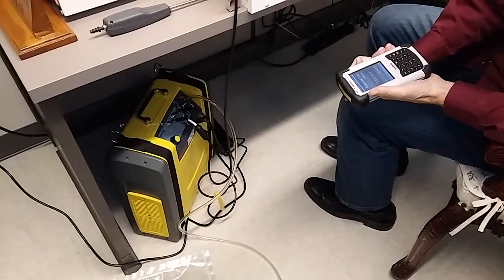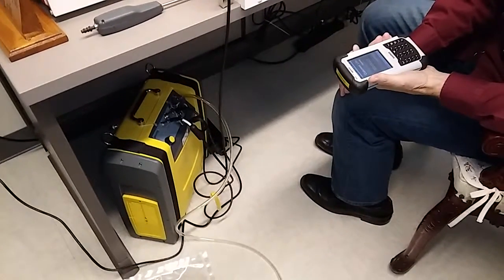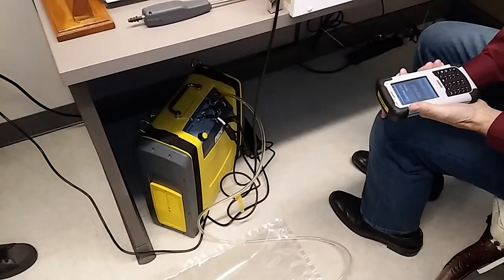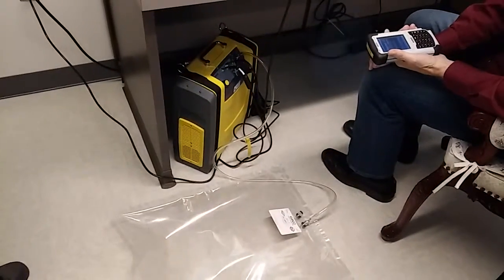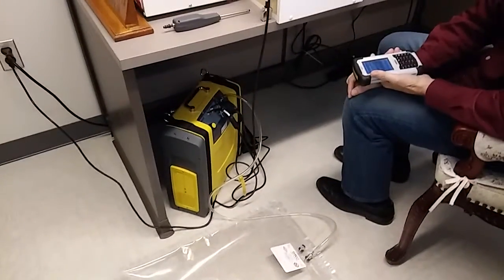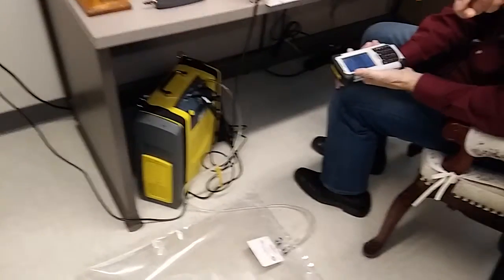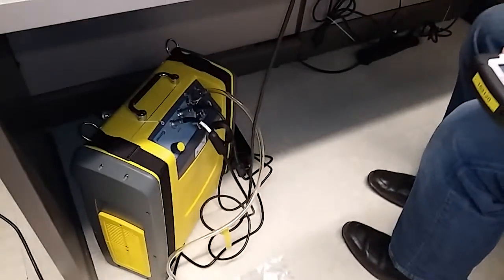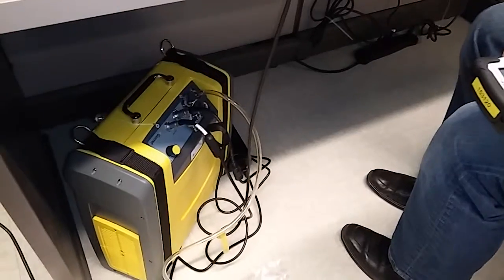Now the fan should come on. I don't hear it though. Well, it says measuring and saving a new background. Please wait. So it says it's measuring.